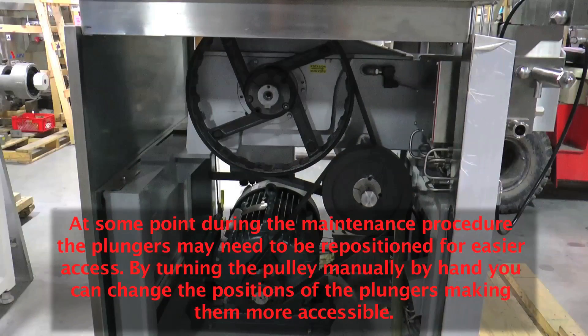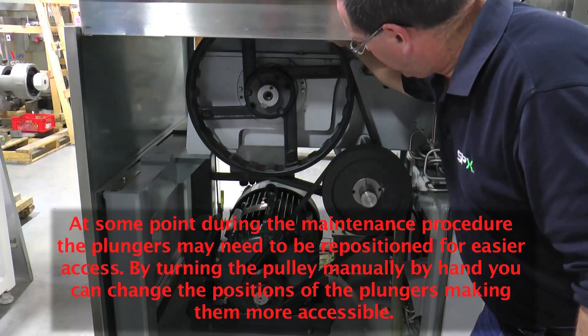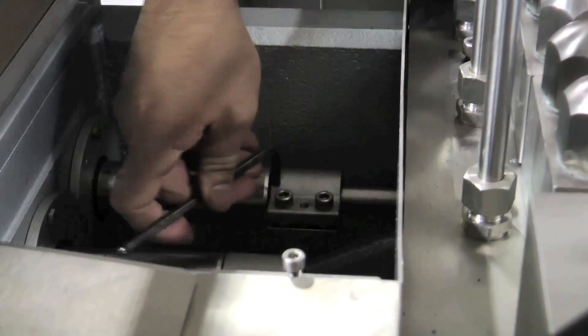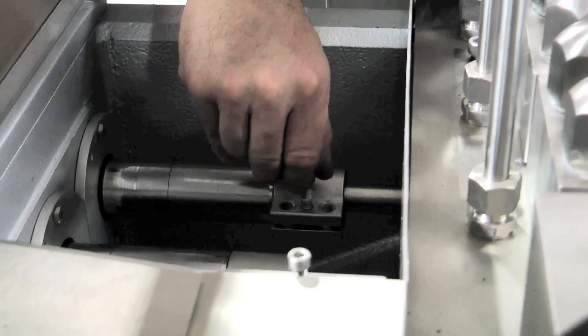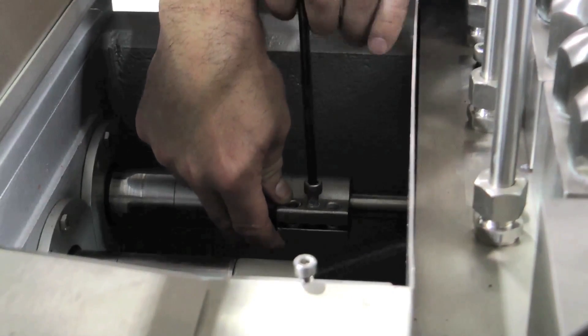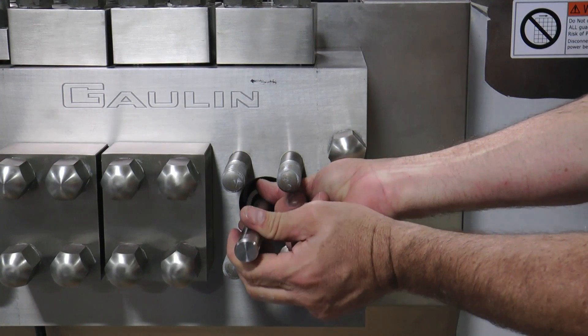At some point during the maintenance procedure, the plungers may need to be repositioned for easier access. By turning the pulley manually by hand, you can change the positions of the plungers, making them more accessible. Disconnect the coupling from the plunger by removing one of the socket head cap screws and loosening the other two full turns. Take the removed socket head cap screw and thread it into the jacking hole and tighten. This will separate the coupling and allow it to be slipped off the plunger, which can then be removed through the front of the cylinder block.